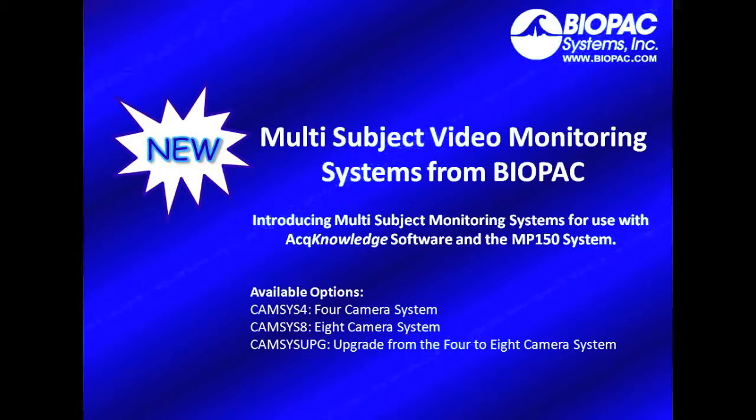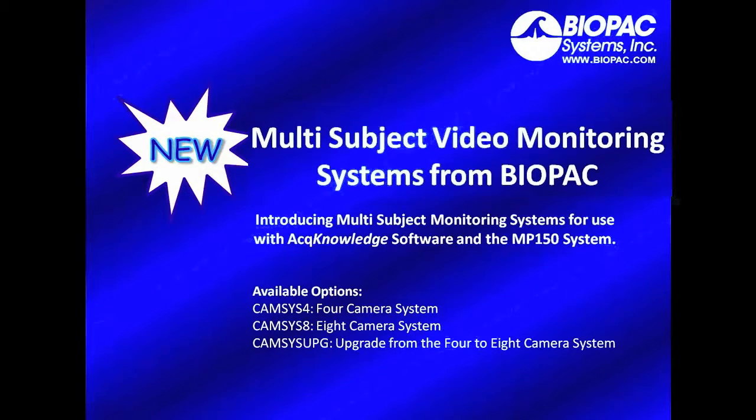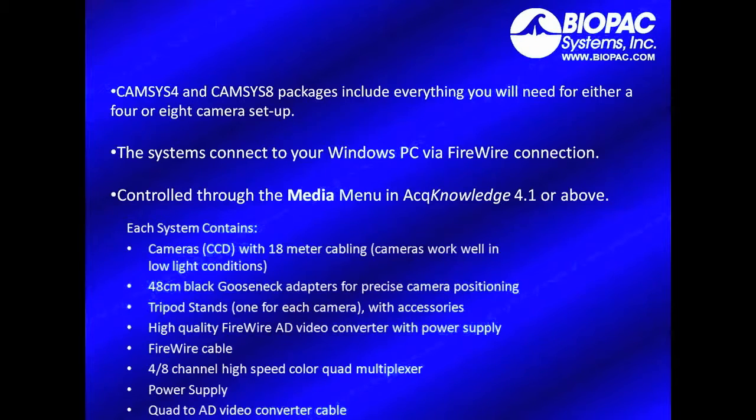New from Biopac Systems, Biopac is proud to introduce multi-subject monitoring systems for use with Acknowledge software in the MP150 research system. Available options include a 4 or 8 camera system, as well as an upgrade from the 4 to the 8 camera configuration.